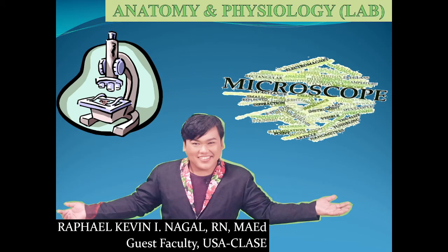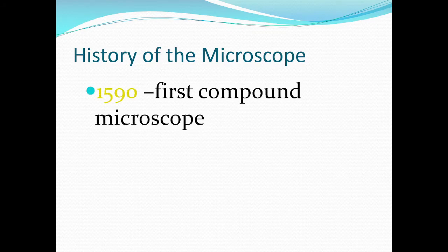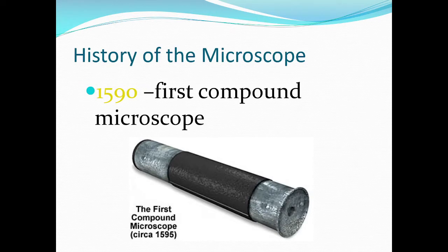Today's topic will focus on the microscope. Now, where did the microscope start from? The very first compound microscope was invented in 1590, and it looks like this one.